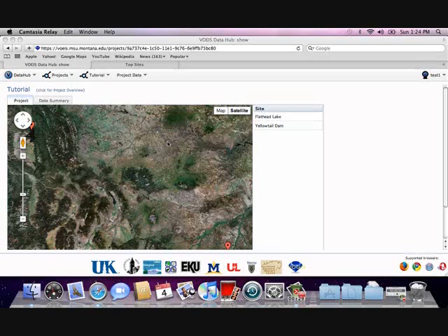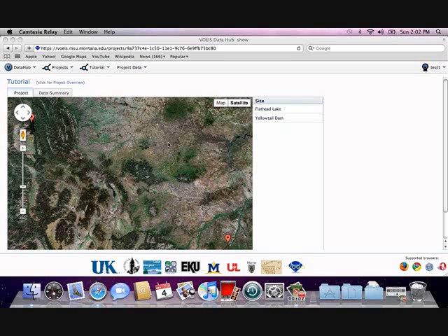Data files must include sample IDs, date or time stamps, and sample values for one or more variables. Data must be organized to include individual columns for sample IDs, date timestamps, and variables such that a given row contains sample data values that were measured from a single sample collected at a specific date or time. If sample data is organized in a spreadsheet, it must be saved as a CSV file prior to loading data into VOEIS. Now let's begin to load some data.